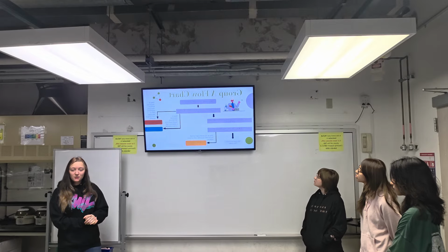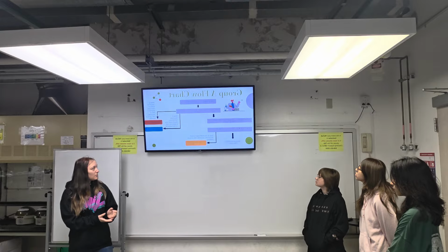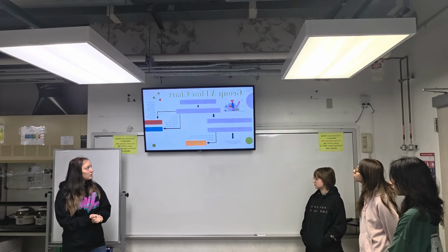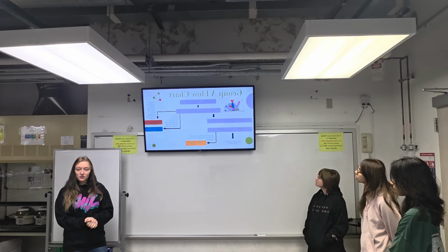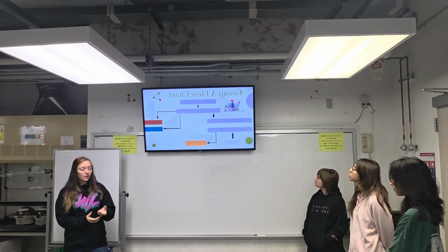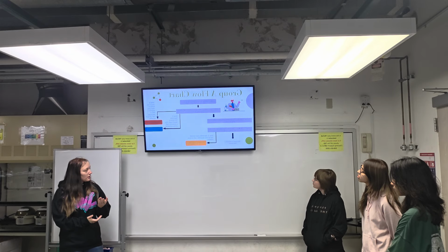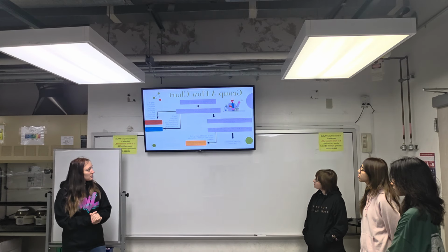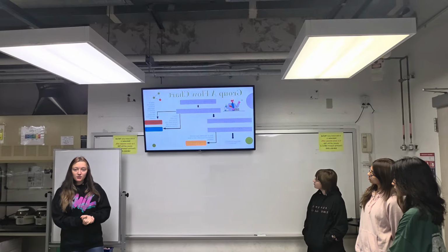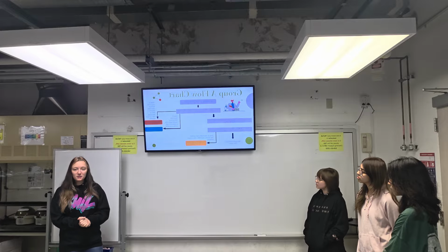And in step 4, we still had our orange dye and our mordant together. So we had to add another 1 milliliter of cyclohexane and 1 milliliter of DI water, and we shook it to mix as well. From here we used the Hirsch funnel to separate the solid mordant from the rest of it. So we had the mordant on the filter paper now, and we just had to separate the orange lake pigment, step 6, from inside the Hirsch funnel vial, just using a pipette as well, and that sat in the DI water.